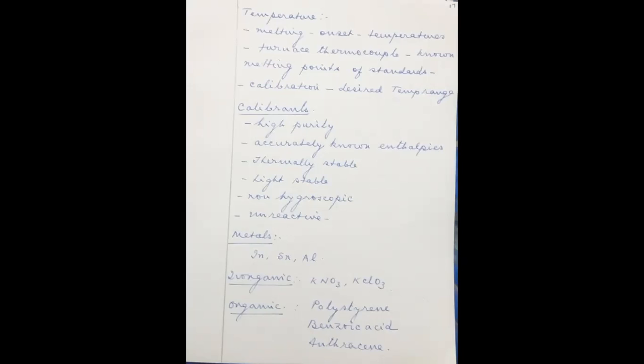Even when you studied the bomb calorimeter in the second year, which is used to find out the enthalpy of combustion, you just calibrated the instrument with benzoic acid, because benzoic acid's molecular formula is known, and its enthalpy of combustion is also accurately known.